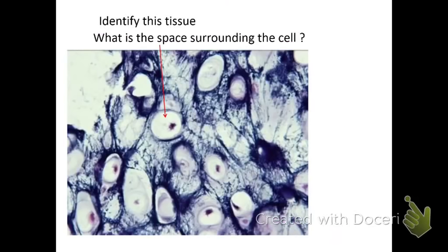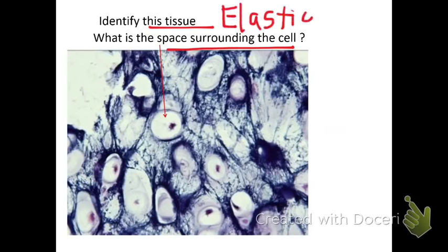Take a second and try to figure this one out — identify the tissue and the space around the tissue. This one is elastic cartilage. You can see the elastic fibers right there; this one's in your ears. And that space is the lacuna.